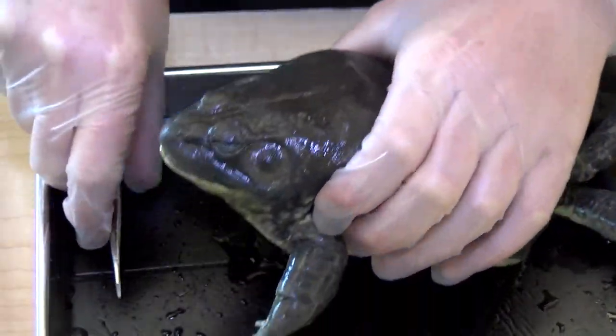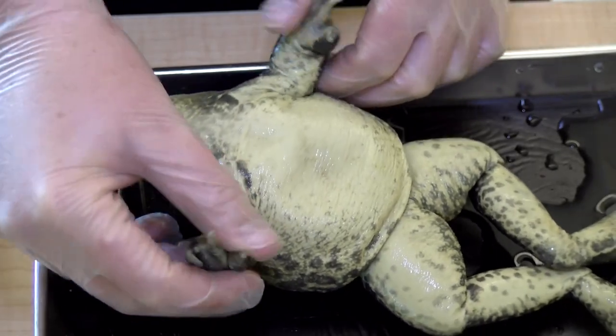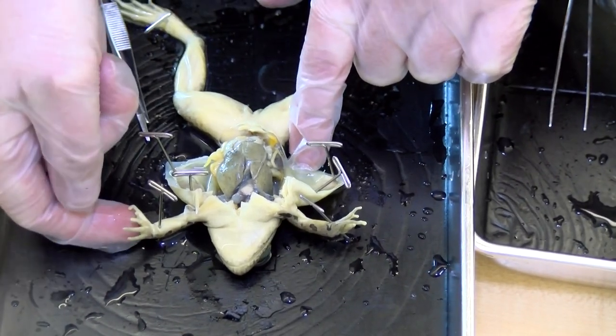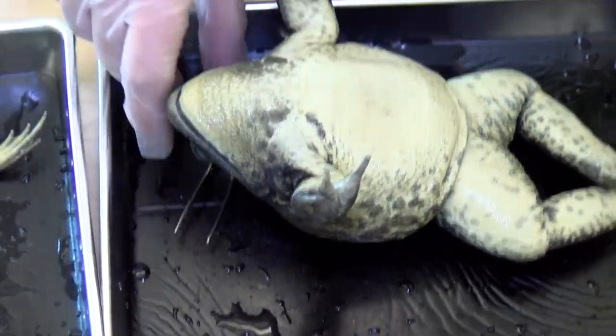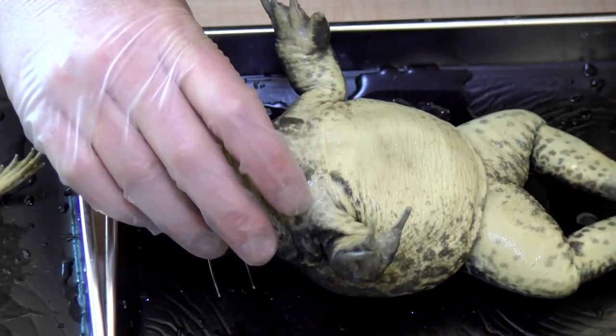Another neat thing about a frog is you can tell whether it's male or female based on its thumbs. This little frog over here has very small thumbs — they're not enlarged. But this frog has an enlarged thumb, which means that it is a male frog.